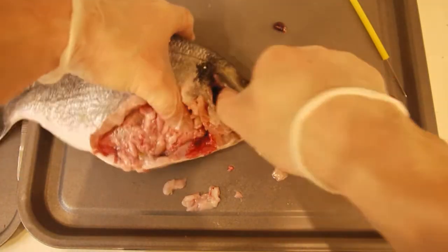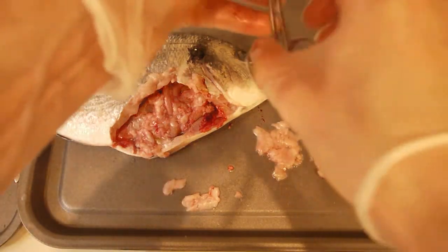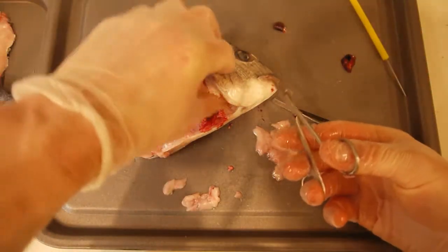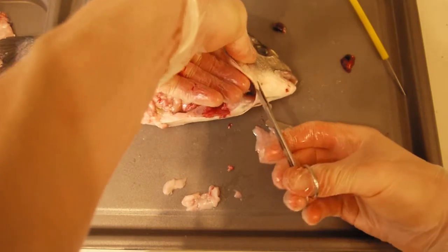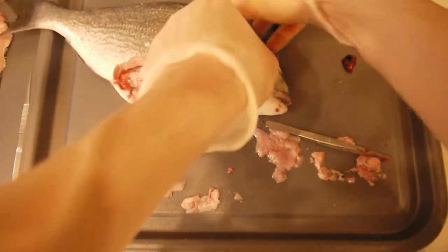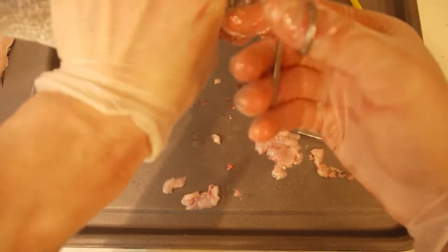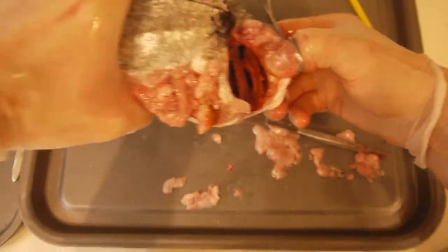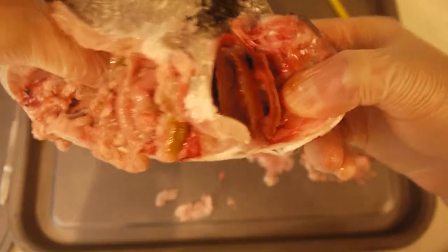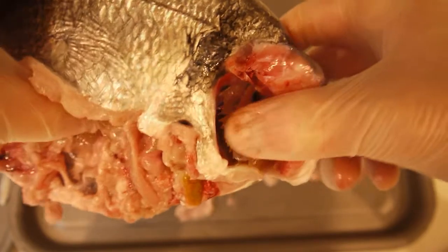Now let's have a look at the respiratory system, which in a fish means, of course, the gills. To have a look at the gills we're going to have to snip away the gill cover, which is known as the operculum. And you can now see those lovely gills. That plumbs directly into the circulatory system.